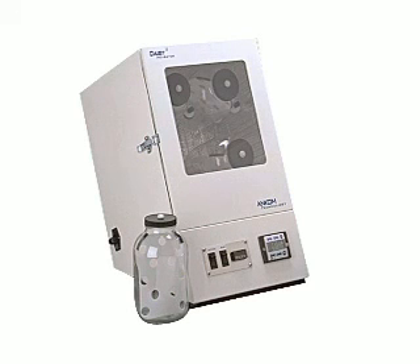The DAISY-2 Incubator provides an in vitro method for measuring digestibility. Commonly used for in vitro true and in vitro apparent digestibility, the DAISY-2 greatly simplifies these analyses.